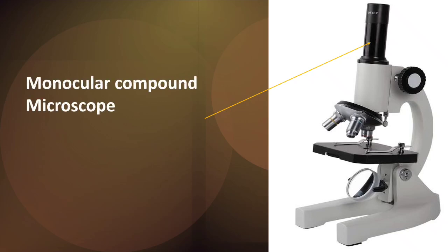If you look at this particular image, it is also a microscope. Yes, we also use this, especially in the secondary school laboratory. This is a monocular compound microscope.